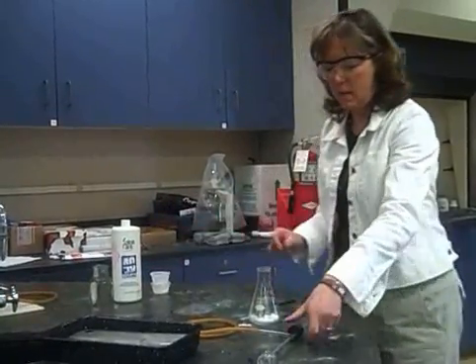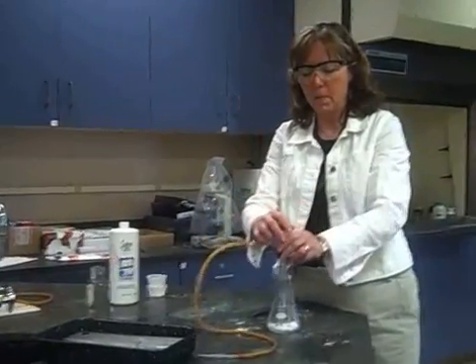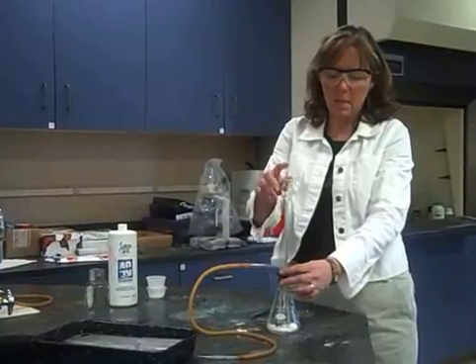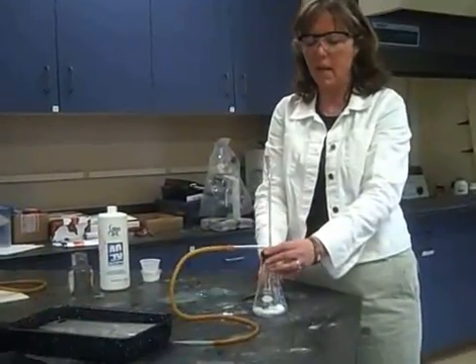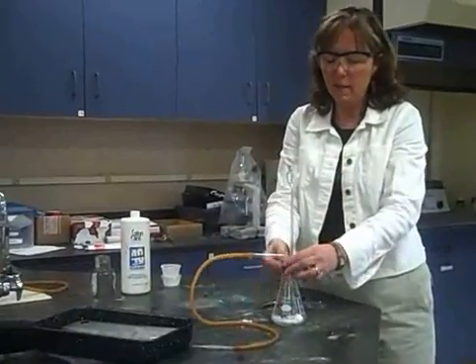I'm going to empty that container into the flask — it looks like that. Notice I'm going to put the thistle tube — this is the thistle tube — and it's going to be touching as close to the bottom as it can, so that the gases won't be going back up. We want to collect the gas and have it go out this tubing.